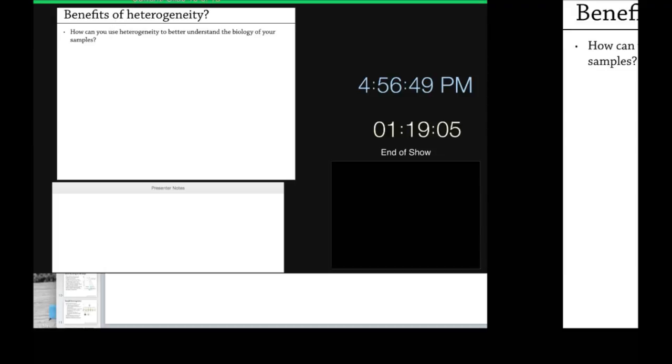Just have a question about trying to understand protein kinetics based on cryo-EM data, because it seems like it would be hard. Let's say you had some long, flexible protein, and you see a range of conformations in one data collection. How could you control for things like ice thickness precisely enough to understand this accurately? Next time, maybe you've added a ligand and you expect it to now only go through 2/3 of the conformations, but this time your ice thickness is thinner, so you're actually eliminating it somehow. What do you think about that?